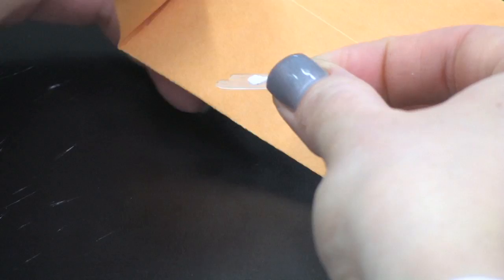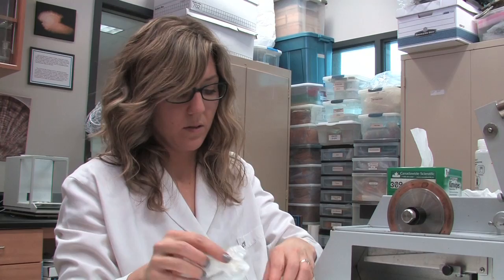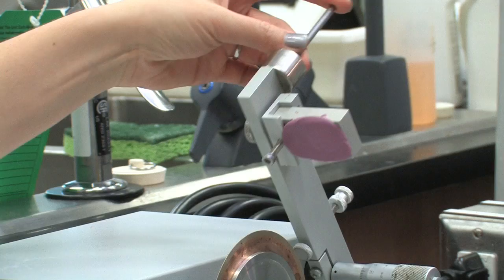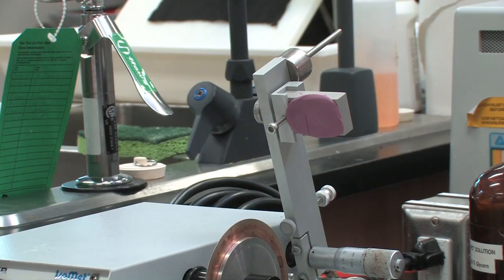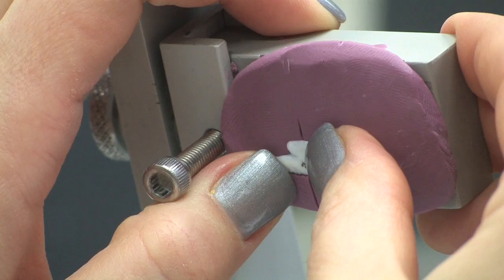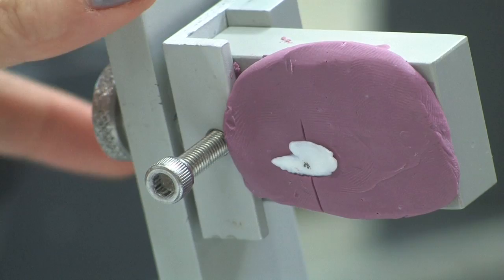To cut unembedded otoliths, a similar procedure to what has already been demonstrated is used, except that we use a single blade and a different chuck to hold the otolith. A piece of plasticine is placed on the chuck and a whole otolith is pressed into the plasticine. A mark can be made on the plasticine by gently bringing the cutting arm down to the blade, which will help you align the otolith properly. Normally, otoliths should be cut with an epoxy mold since the otolith can shift in the plasticine. Make sure to line up the marked core of the otolith so that it is in the center of the blade, and align the otolith as close to perpendicular to the blade as possible — don't cut on an angle.